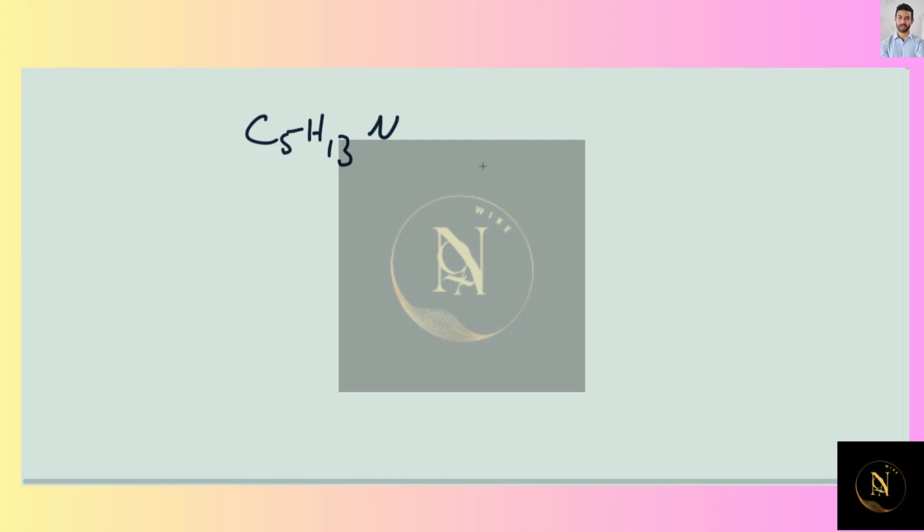Okay, so I've got C5H13N. And before I do any sort of NMR stuff, I'm going to calculate the double bond equivalencies to find out if I have any double bonds. It's always a good idea to do that before you start looking at any spectra.